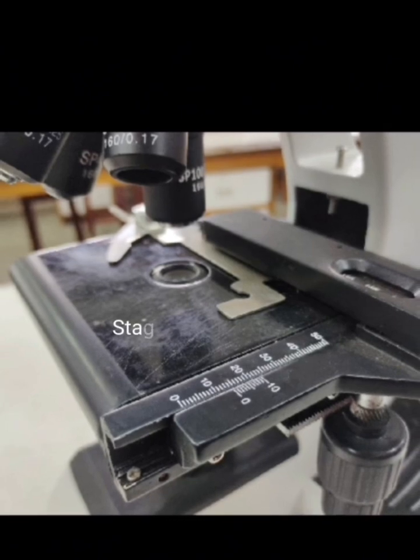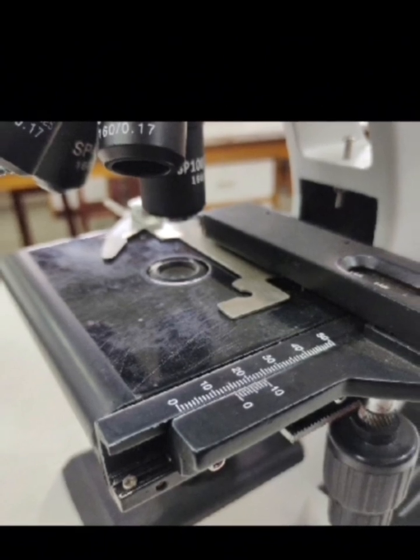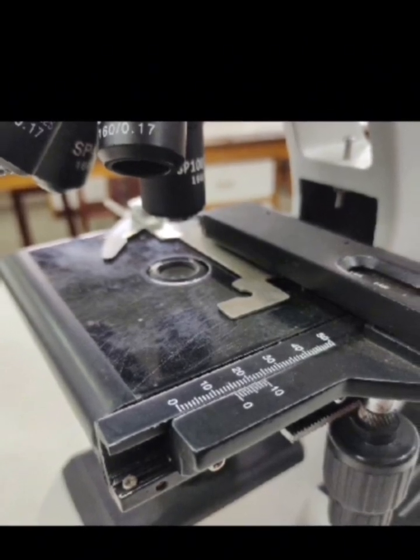And this is the stage. It is where the specimen to be viewed is placed. A mechanical stage is used when working at the higher magnifications where delicate movement of the specimen slides is required.